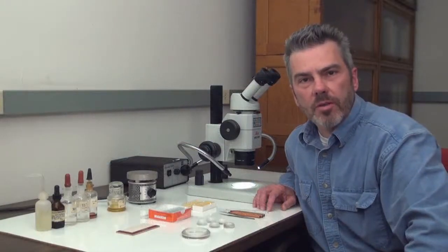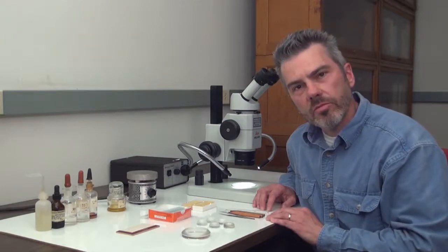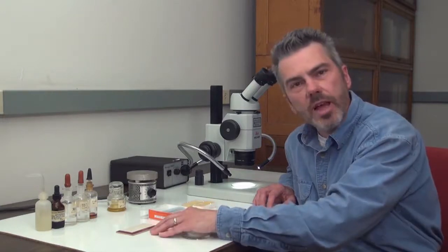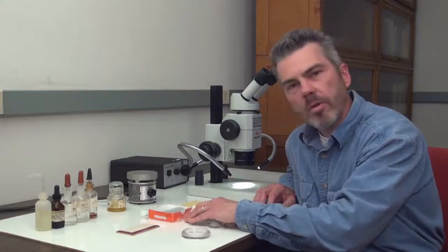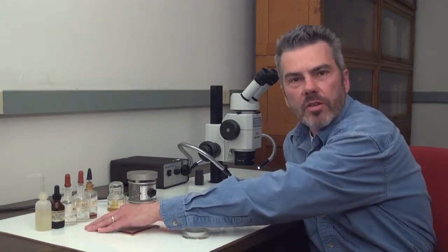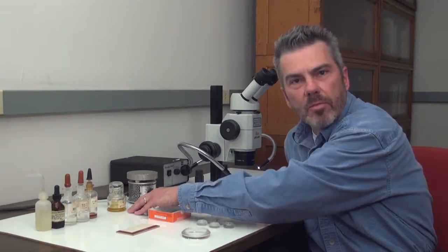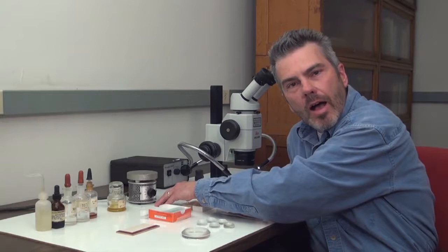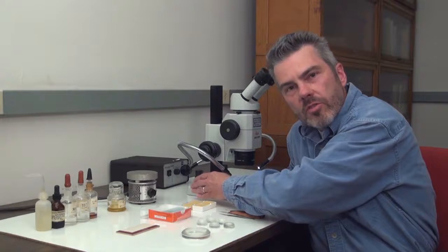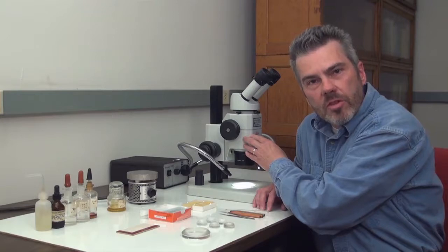So let's go over what you will need to make a permanent microscope slide. You'll need a set of micro tools, a series of dishes for transfers, a slide centering stage, microscope slides and cover slips, your chemicals for clearing, staining, and dehydration, permanent mounting medium, in this case Canada balsam, a hot plate or warming tray, a good light source, such as this fiber optic light source, and of course a good microscope, such as this binocular microscope.